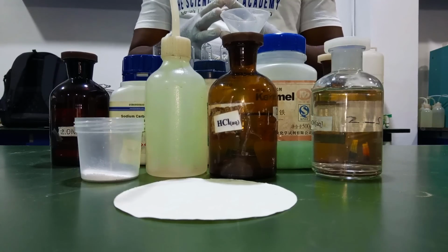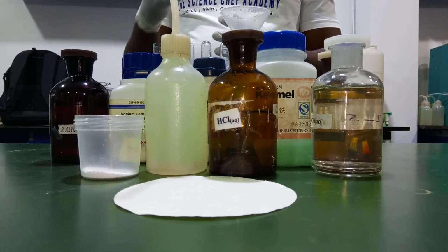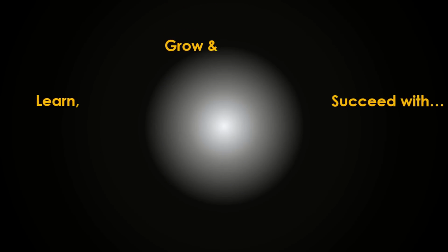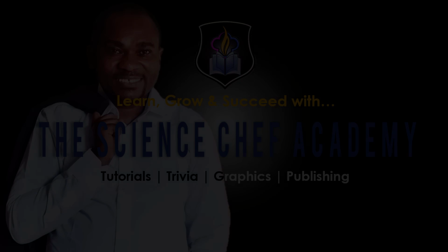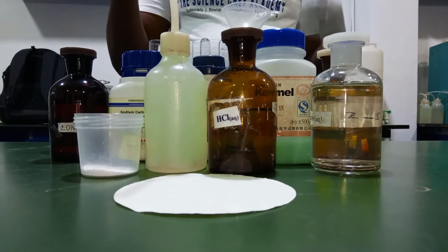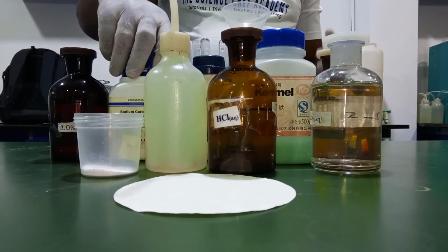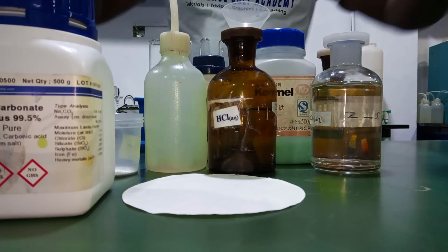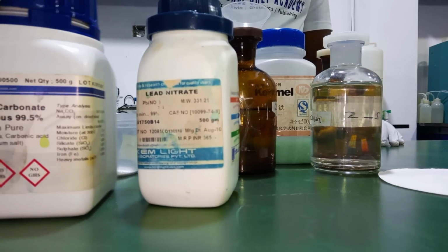In this video, we'll be looking at the second part of our tutorial on the qualitative analysis for the 2024 WAEC Chemistry Practical. The qualitative analysis is about a mixture of two salts, sodium trioxocarbonate(IV) and lead(II) trioxonitrate(V). These are the salts. You can see sodium trioxocarbonate(IV) and lead(II) trioxonitrate(V).